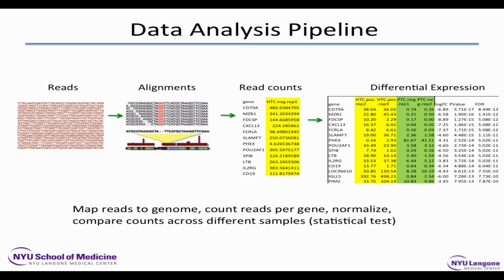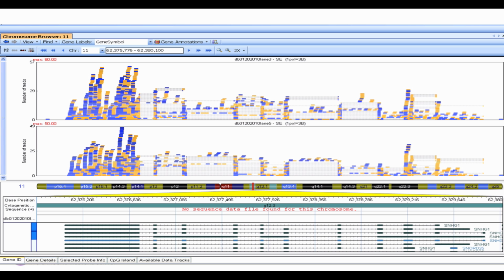So instead, we're going to use the most popular tool called Cufflinks. And I'm not even going to explain the statistical model for Cufflinks. Instead, I'll just show you how to read the paper.